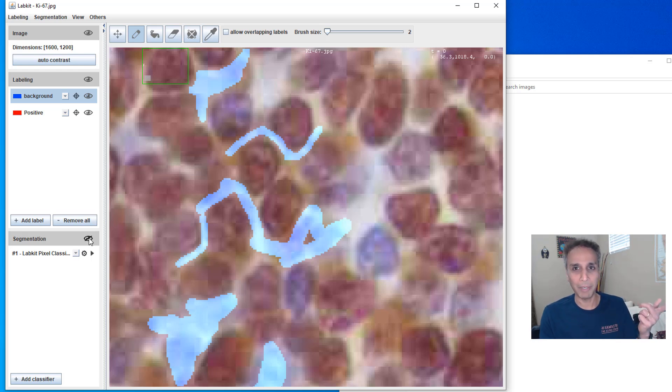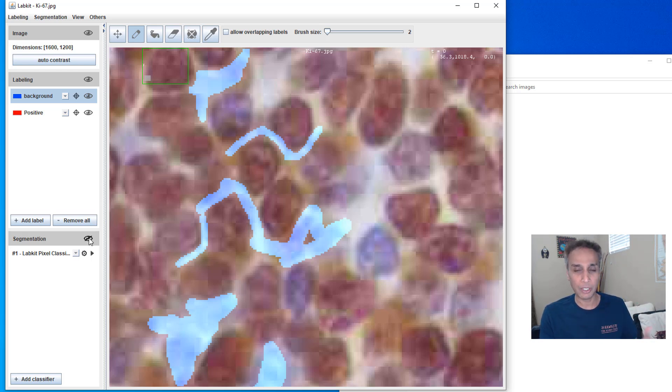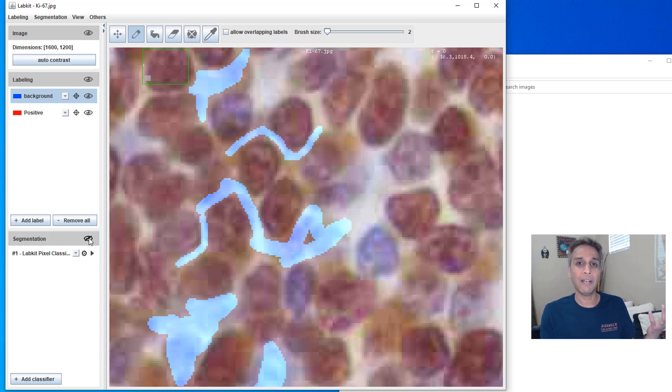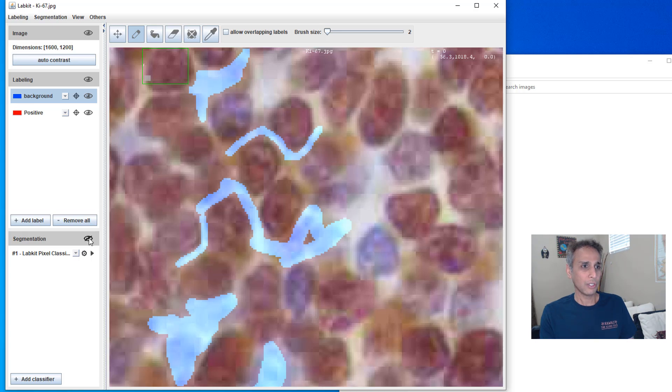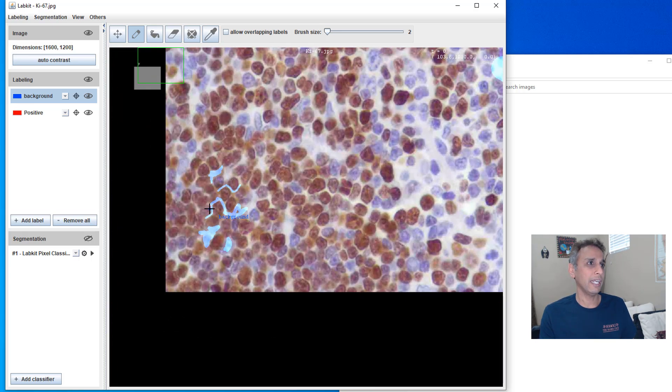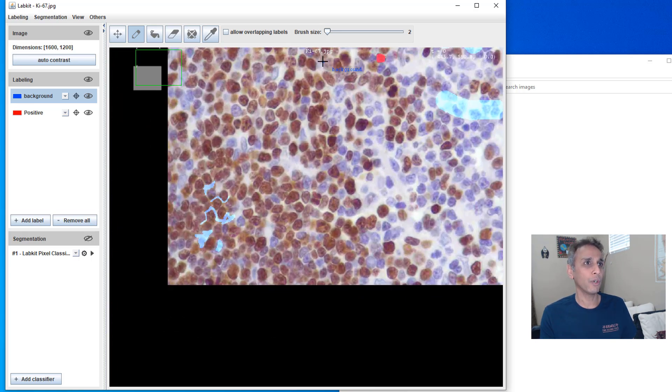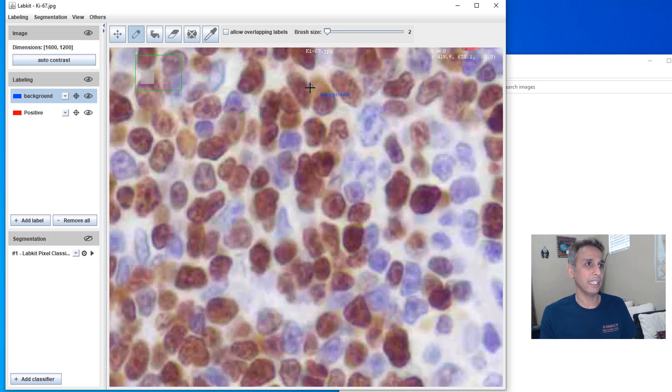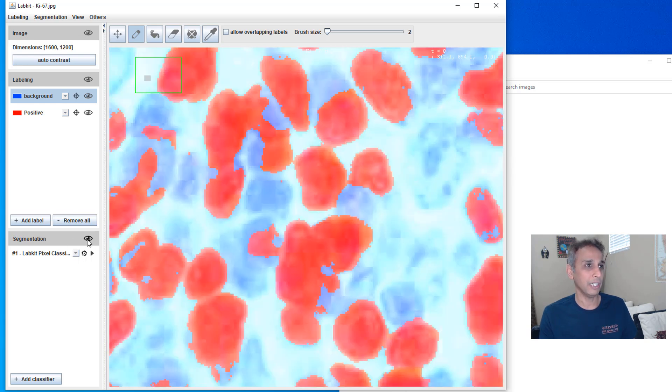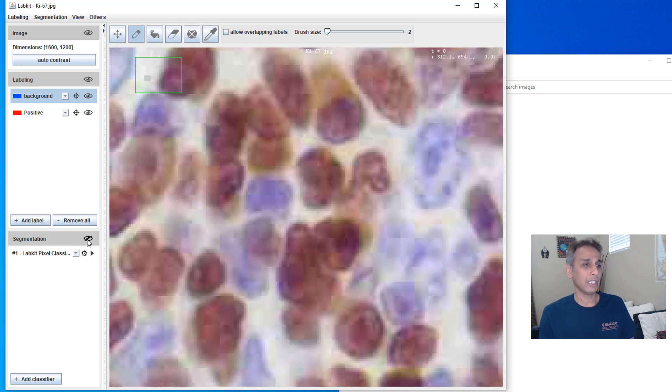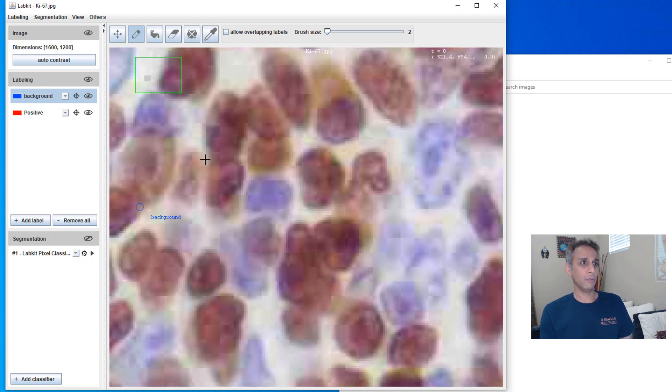But I'm trying to make sure I am, this process works much better on certain images than others. I mean, this one is a complex one where traditional machine learning fails anyway. This is why you need deep learning.